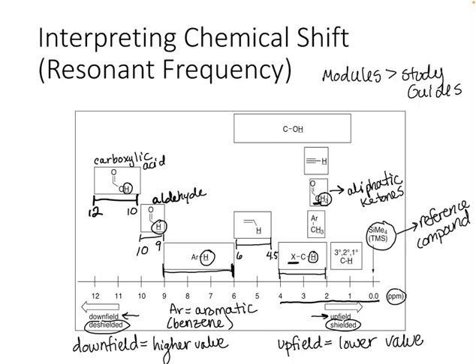It's kind of confusing. We also have alkyne protons and alcohol protons. And the alcohol protons span a very wide range. So it starts to get a little hard to interpret upfield. Now, if you do see a peak from 0 to 2, that's most likely just a regular alkane proton.